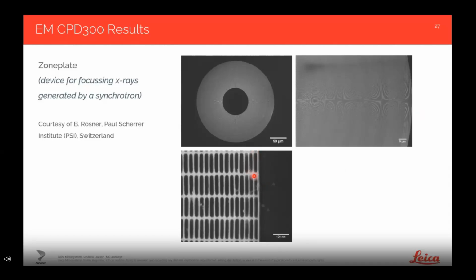It's made up of very, very small lattice structures, maybe about 100 nanometers in height here. Prior to being employed in the synchrotron, it's critically point dried to clean it and make sure it's free of debris, but it maintains its very regular, very fine structure.